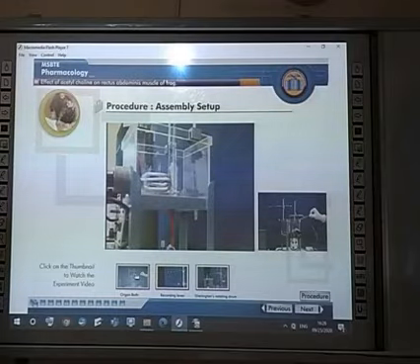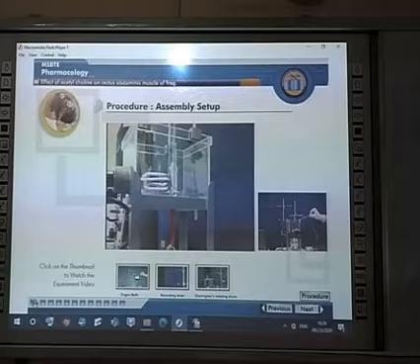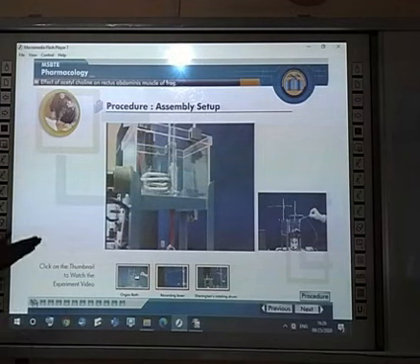The other end of the tube is connected to the aerator. The bottom end of the tissue bath is connected to rubber tubing, which serves as outlet. The bottom side of the organ bath consists of an outlet for removing water from the outer jacket. So this is the organ bath assembly.